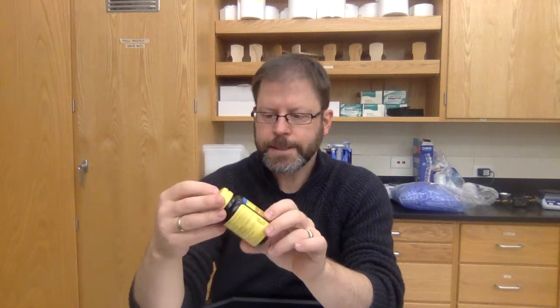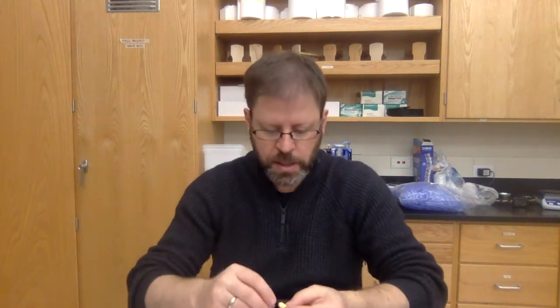So these are supermarket vitamin C tablets, and we are going to pretend that these are highly accurate just to get the point across for what we're doing. I'm sure they're not particularly accurate, but these vitamin C tablets say that there's 1,000 milligrams, so 1 gram of vitamin C in a tablet. Now the tablet is going to weigh more than 1 gram, because when they make the tablets, they also have to put binders in, things that keep it in a nice tablet form. It's not just pure vitamin C. So here's one of those tablets.